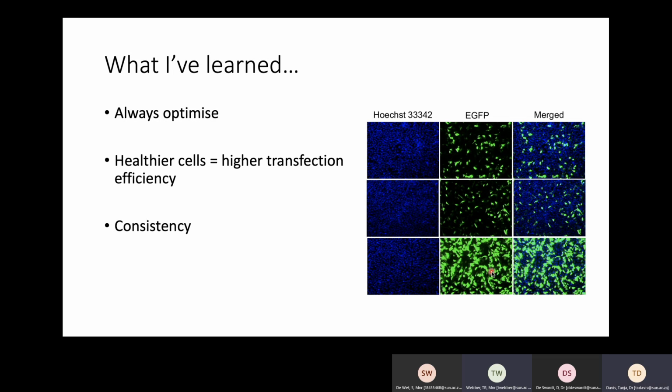Well, to be honest, I've used siRNAs before, but for that I've used a transfection reagent alongside. You say they get sufficient efficiency and that they're seeing an effect.